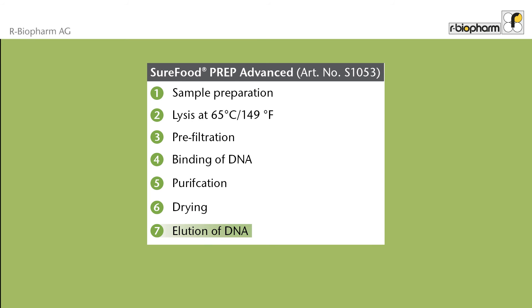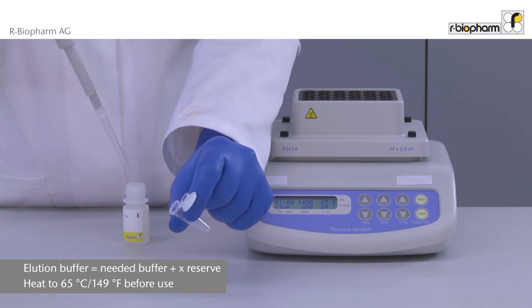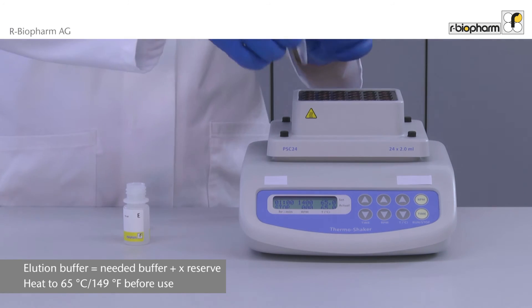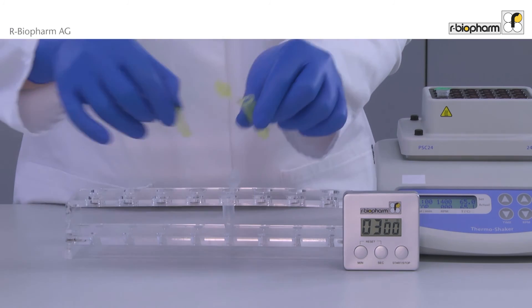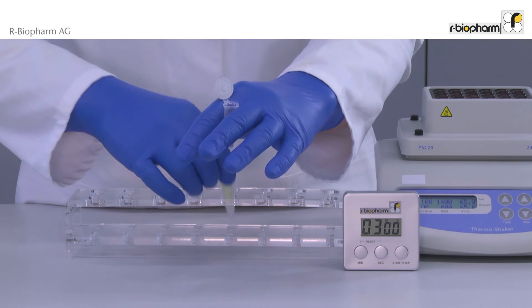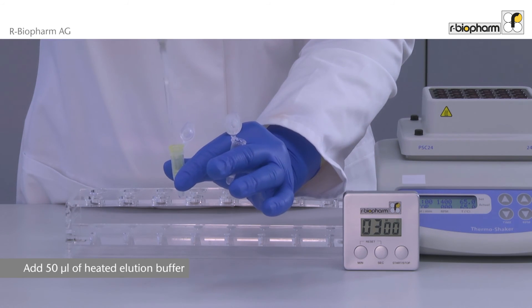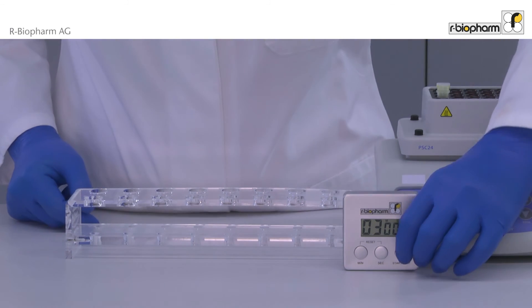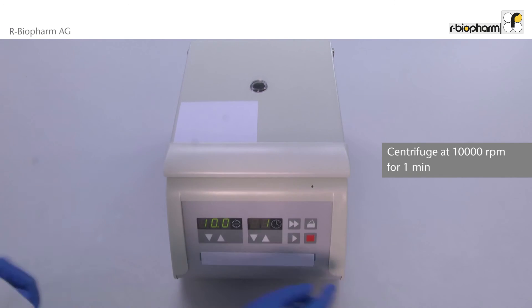In the last step, the purified DNA is dissolved in the elution buffer. Transfer the needed amount of elution buffer into a reaction tube, then heat the elution buffer to 65 degrees centigrade. Place the spin filter carefully into the new clear 1.5 milliliter receiver tube. Then add 50 microliters of the heated elution buffer directly onto the spin filter. Incubate for three minutes on a heating block. Centrifuge the clear receiver tube with the yellow spin filter at 10,000 rpm for one minute.